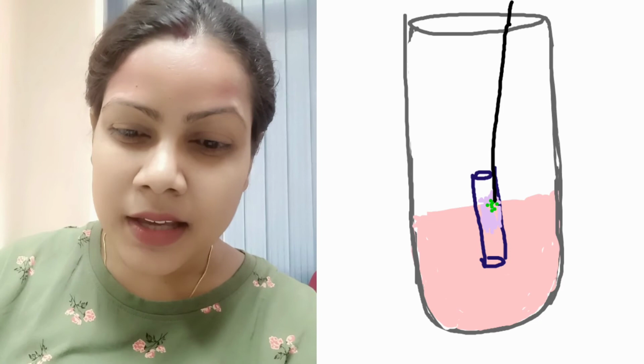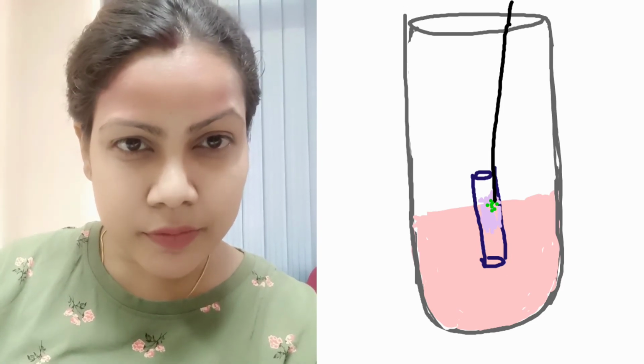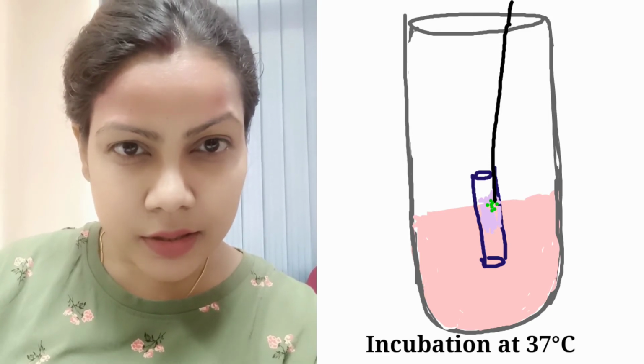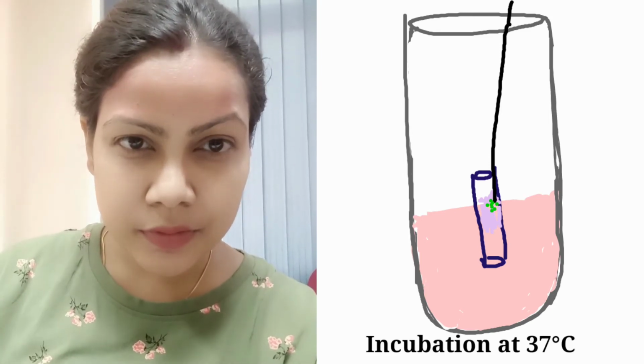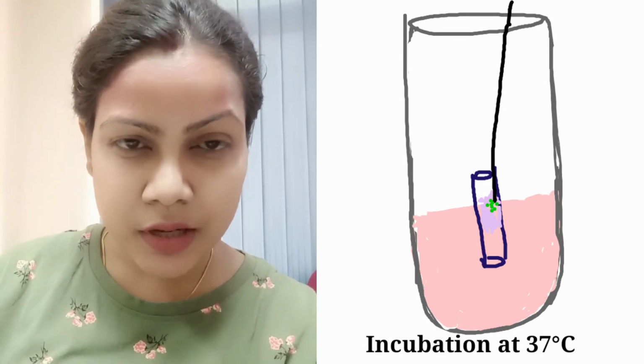After inoculation, we allow it to incubate at 37 degrees C for 24 hours. After 24 hours, we observe the result.